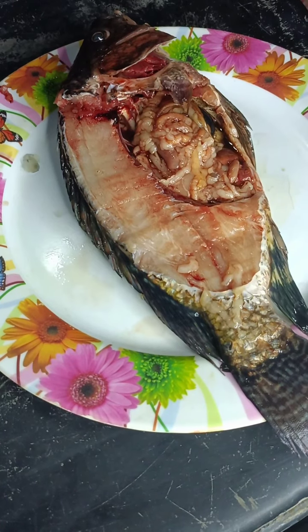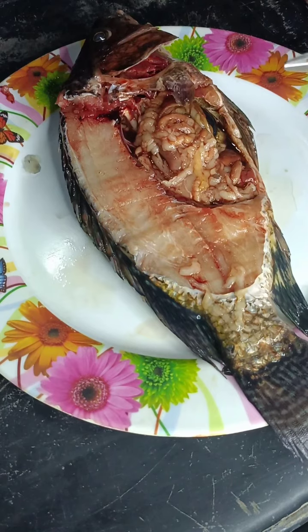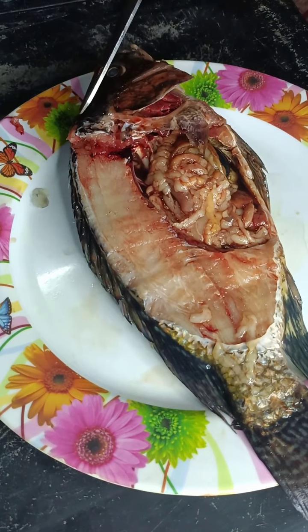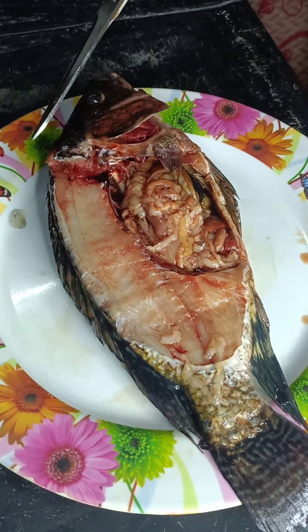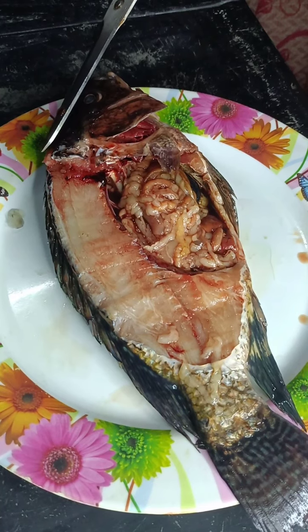So we are now going to discuss the internal part of the fish, of which the first one is the brain. The brain is here. I was not able to show it because it was cut. Basta, it's there. The main function of the brain is to control and learn from emotional responses.